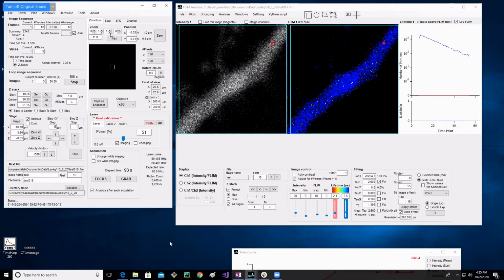Okay. Thank you. You'll notice that if your slices are not very healthy, you still do get transfection. Often the neurons that are transfected are really deep. And that's because the neurons on top tend to be sort of dead, and so they don't express your construct. The deeper neurons tend to be more healthy, and you might get some transfected neurons there, but you'll find it's actually really hard to do experiments on those neurons because the signal will be dim and the spines will be deep. So you can try, but it can be difficult.